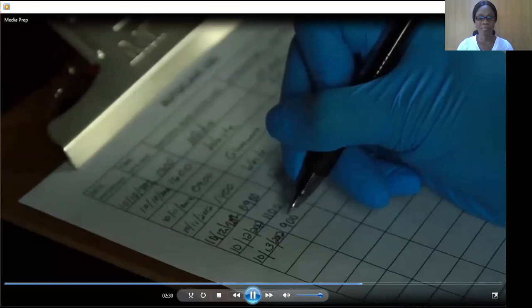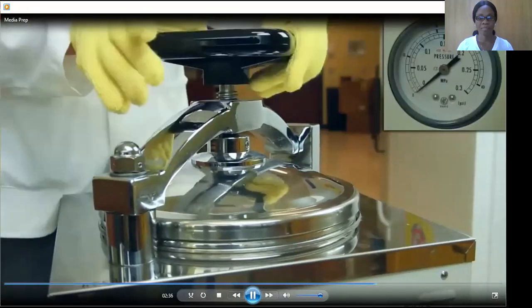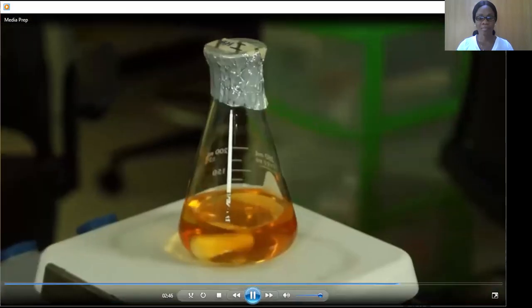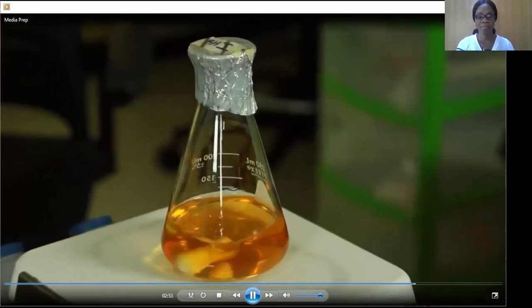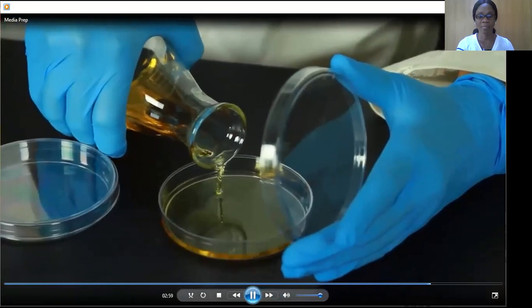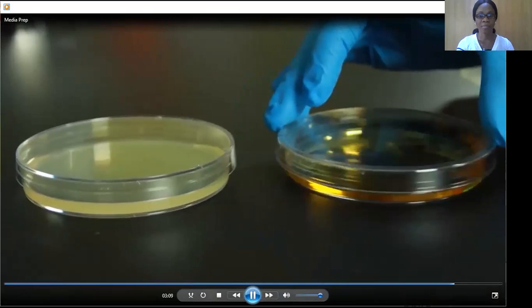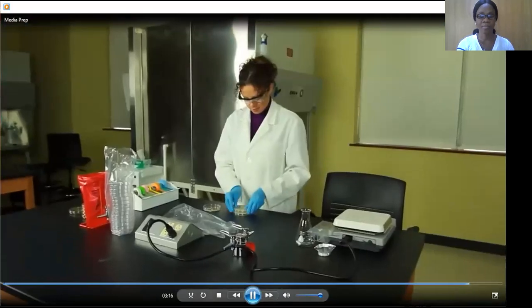While it's running, enter the date and time and the operation details in the log and initial. Once the cycle ends and the pressure gauge reads 0 PSI, use heat-resistant gloves to slowly open it and remove the sterilized flask. Once the media has cooled, it will solidify into the petri dish on the left and set up upside down to prevent moisture from condensing.